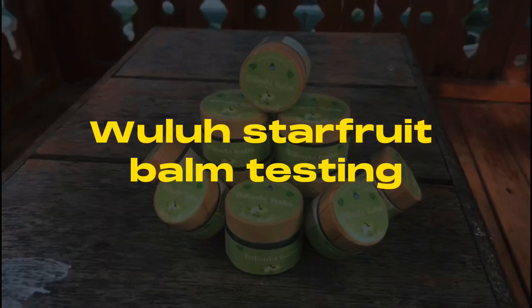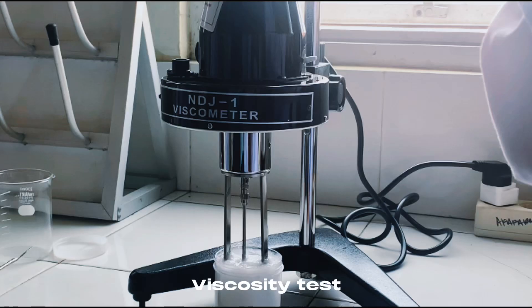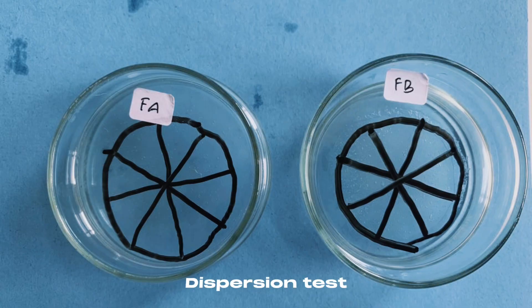Star fruit balm testing: homogeneity test, viscosity test, pH testing, and dispersion test.